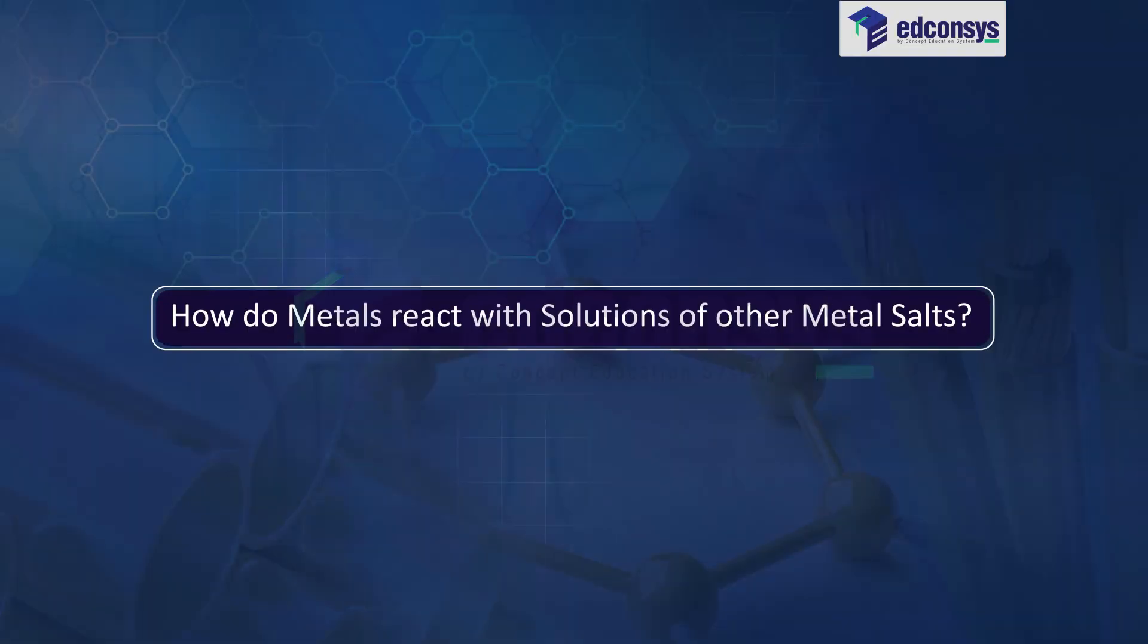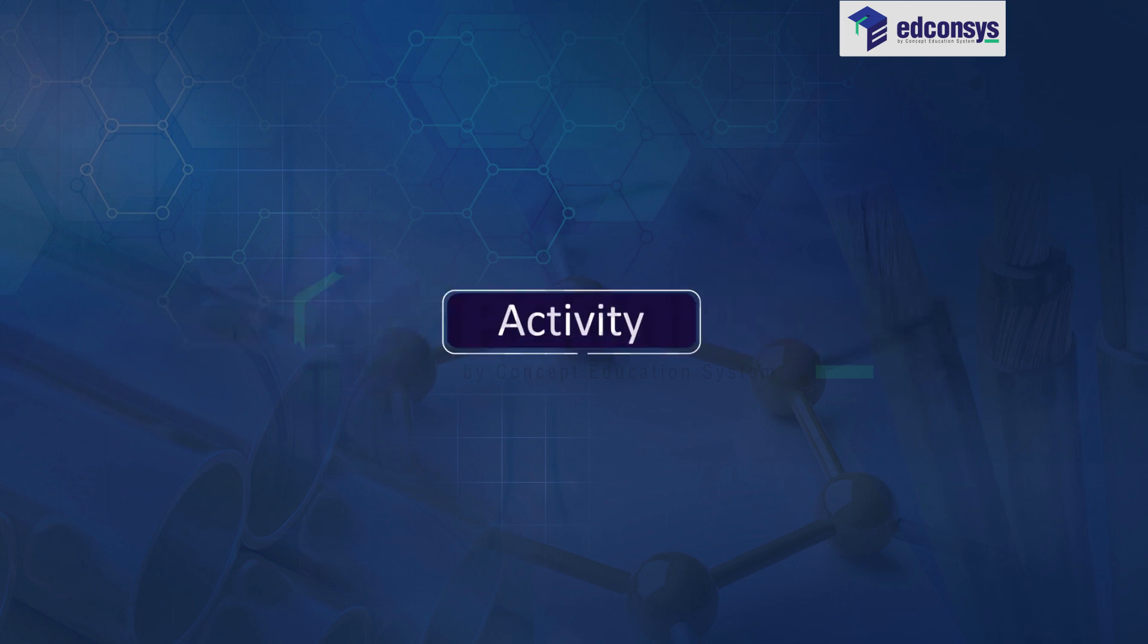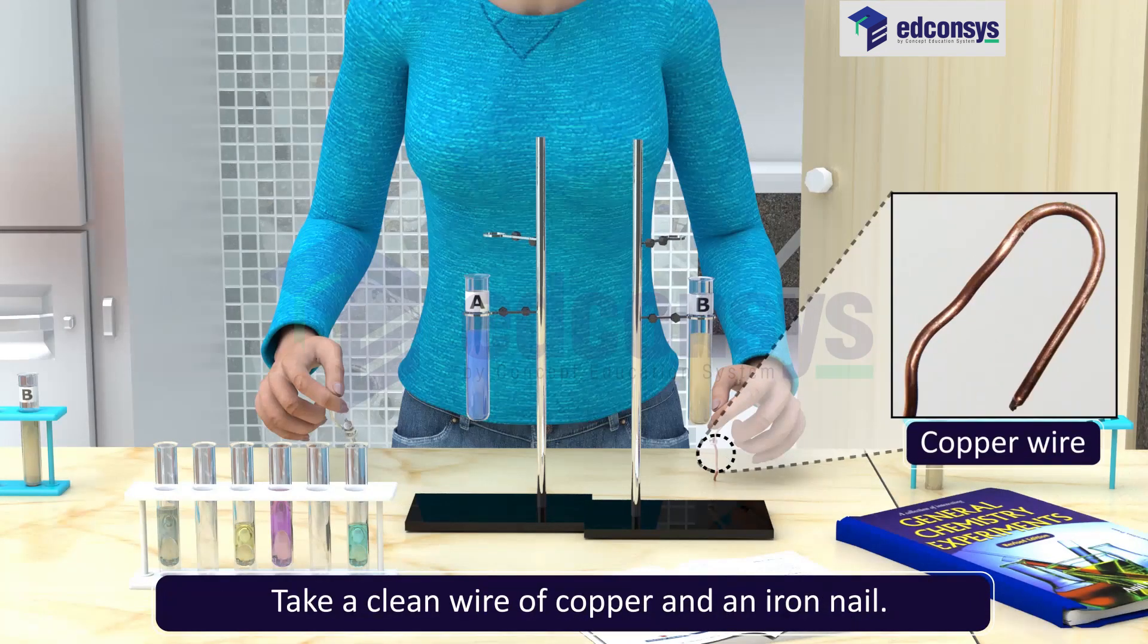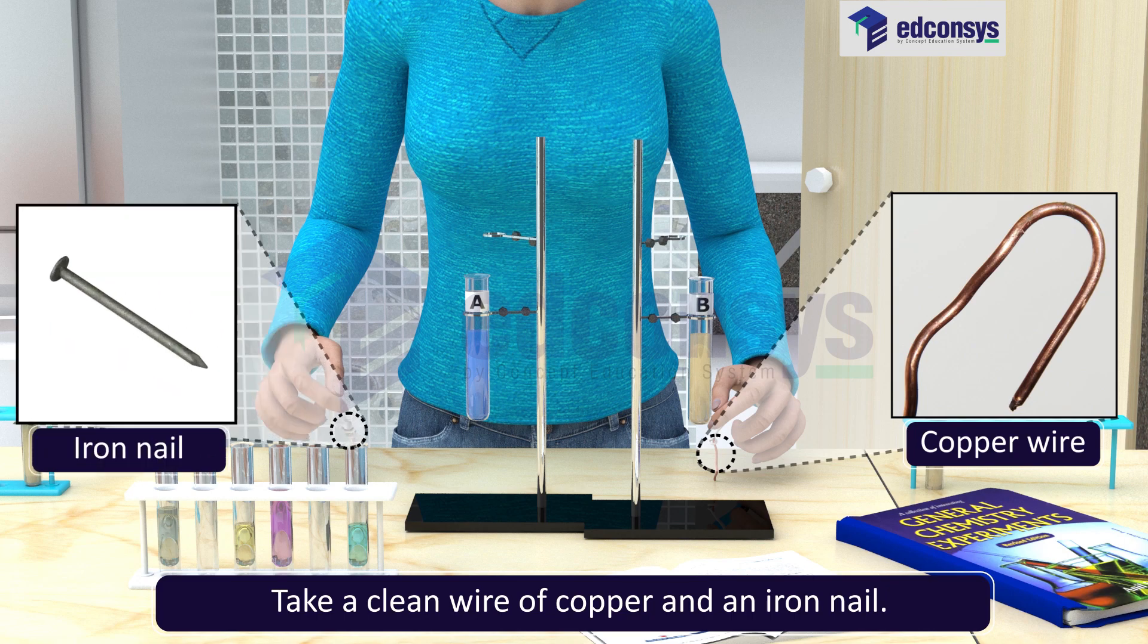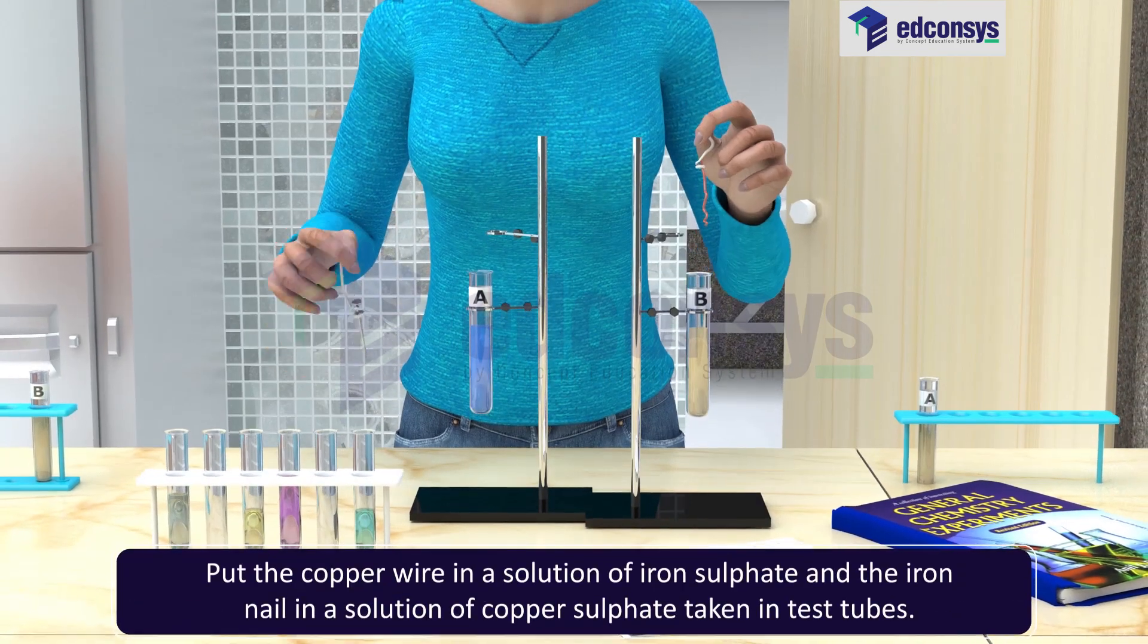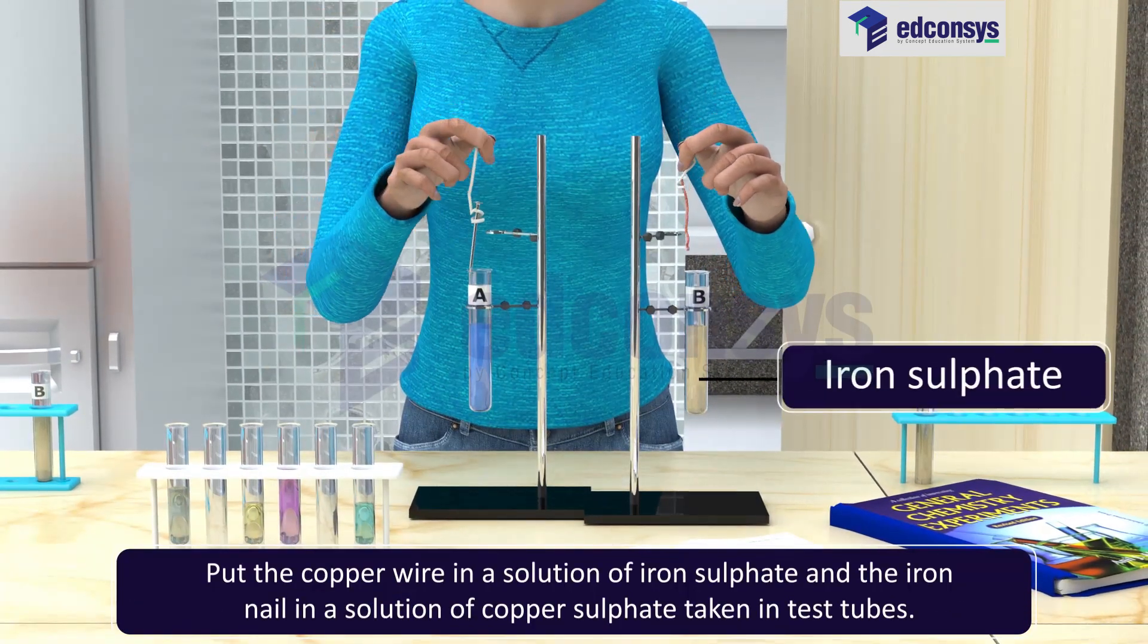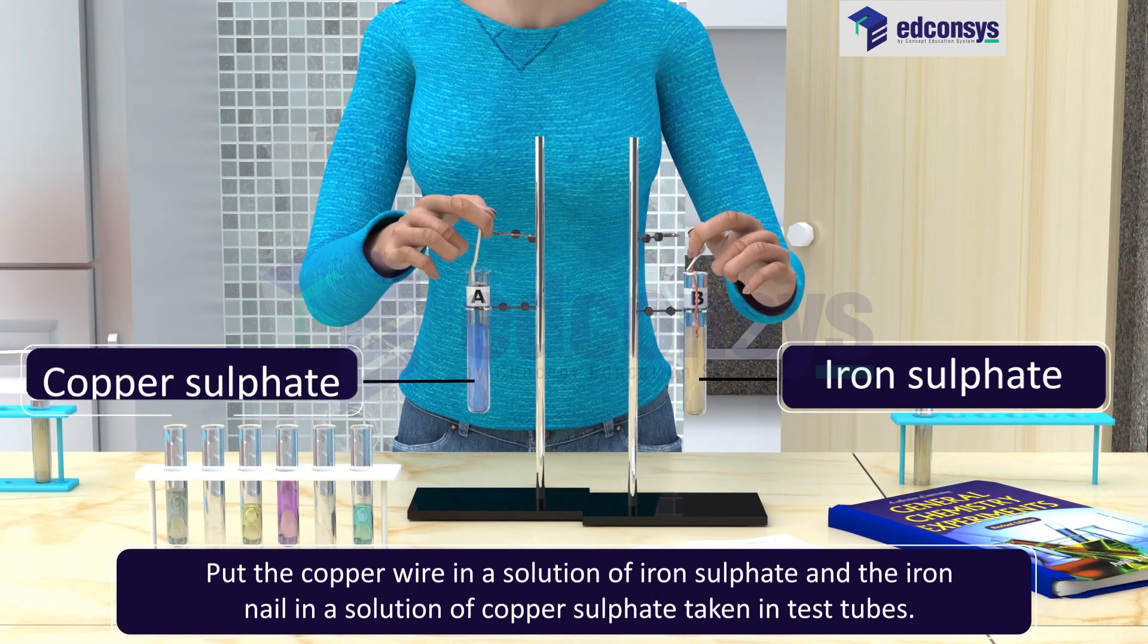How do metals react with solutions of other metal salts? Activity: Take a clean wire of copper and an iron nail. Put the copper wire in a solution of iron sulfate and the iron nail in a solution of copper sulfate taken in test tubes.